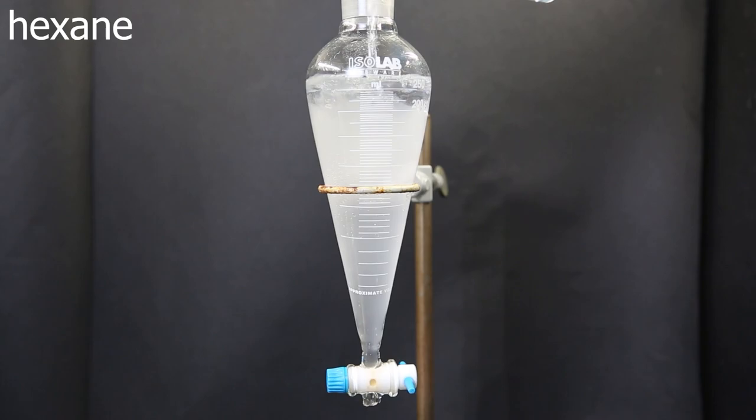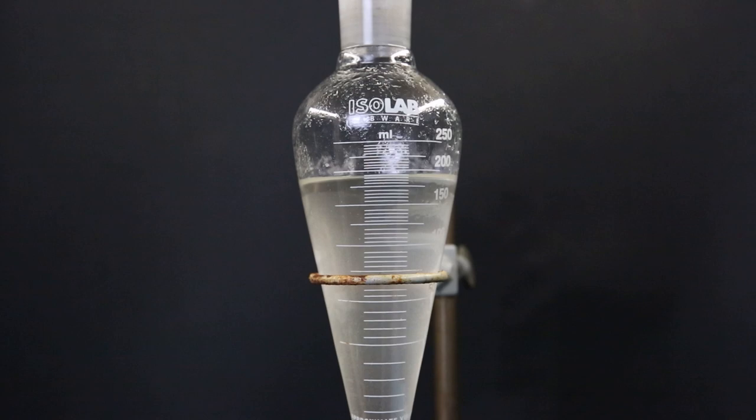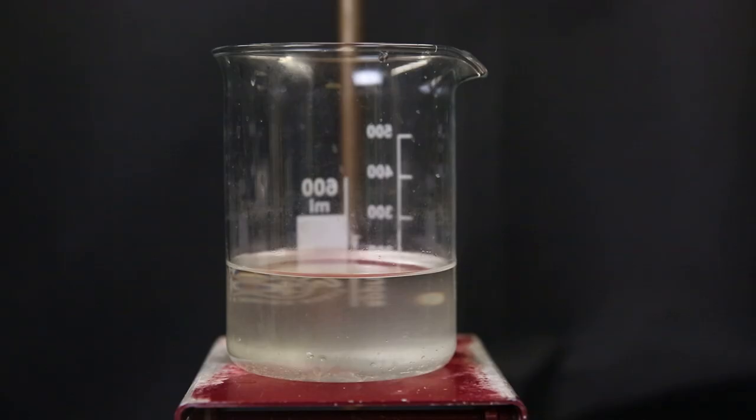I add the hexane to the distillate and shake it around. And we can see some of the cloudiness has moved into the hexane. Now I do the same to the whole distillate. And in the end, I am left with a bunch of hexane that should contain the lemongrass oil.